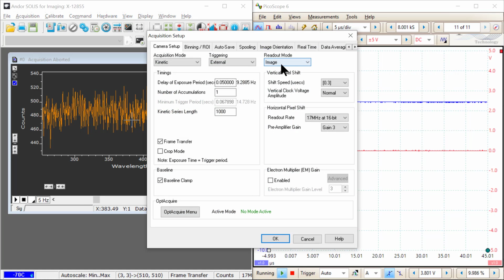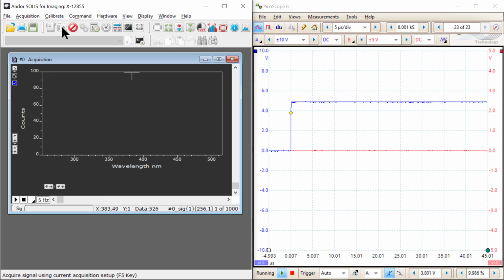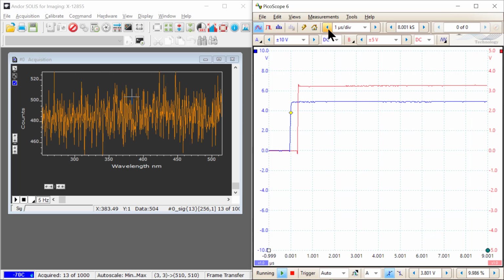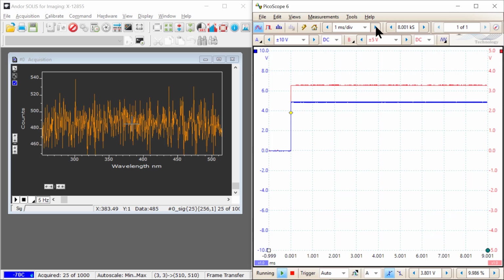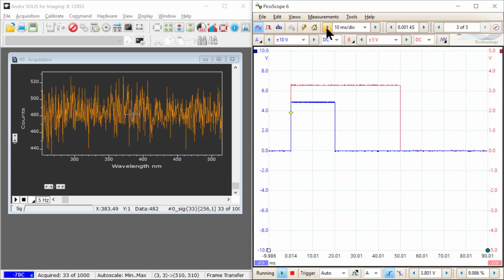So the other thing that I can show, I just wanted to show real quick, if I zoom all the way out, and I have to get to where I can see multiple milliseconds on the same frame.